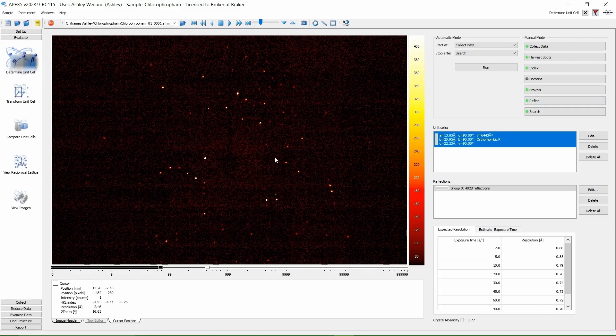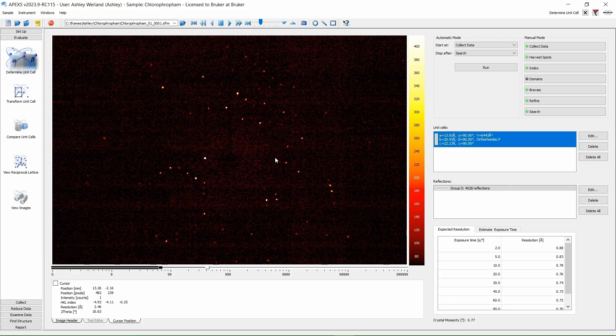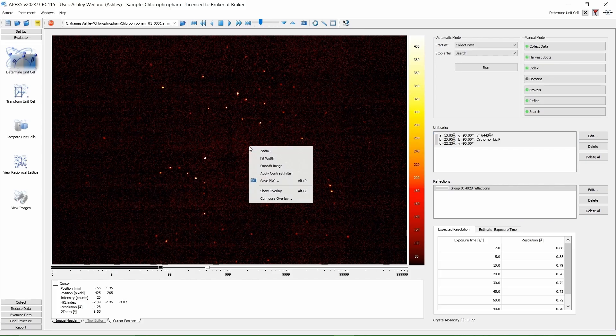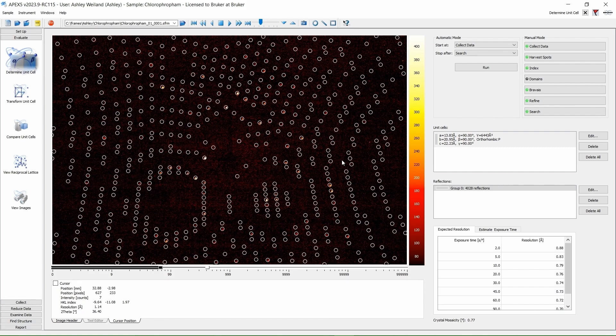To see how well this relates to our actual data, right-click on one of the frames we collected in our 3-minute fast scan and choose Show Overlay. This puts little circles where reflections could be in this unit cell.